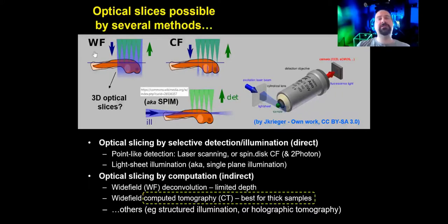And it's extremely difficult to obtain a tomogram when you're doing imaging in wide field illumination and detection mode. Now, you can be a bit more precise, more selective in how you either illuminate or detect your signal from your sample, and that's what you do with confocal microscopy, where you selectively illuminate point by point the sample, and you're very selective in how you detect the light that emanates from that point that is swept across your sample sequentially.